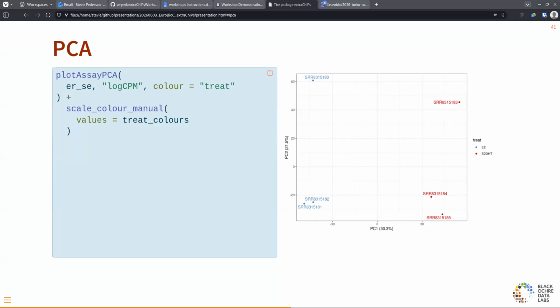Does it take all features or only the top X%? By default, it will plot all points, but you can set it to, and we'll do that later, random sampling rather than top features. And perhaps I should add that as a capacity. Yeah. When we get to the HDK data and we've got genomic sliding windows, that takes ages to plot, and so you just downsample that. But yeah, I could actually set that to be the top features. That would be smart. Thank you.